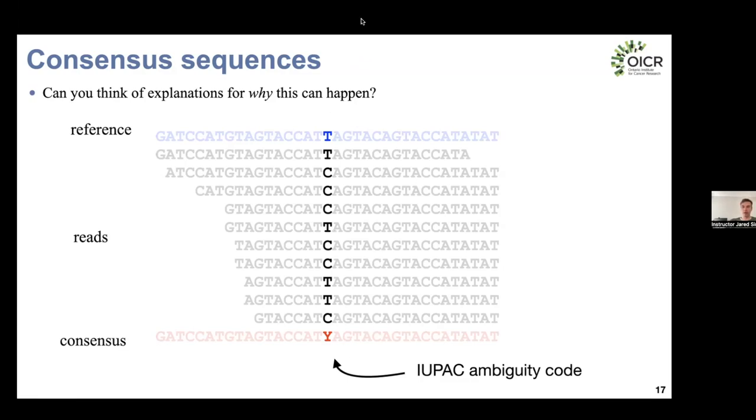I think I saw a hand go up there. Stephen? Yeah, I just have more of a question from your experience in the field. A lot of times when labs are dealing with pathogens, the people handling samples probably wouldn't be infected with what they're handling. But for SARS-CoV-2, because of the amount of the population that's probably asymptomatic or just not realizing they were infected yet, like lab staff, was there a higher rate of negative controls coming back positive? Was contamination a lot harder than with other things you've dealt with in the past?